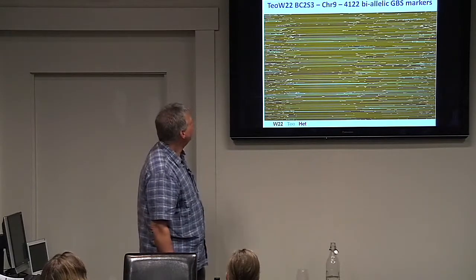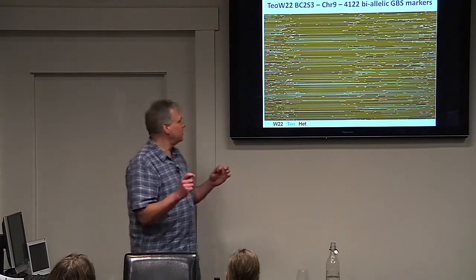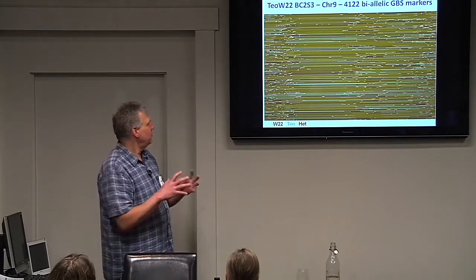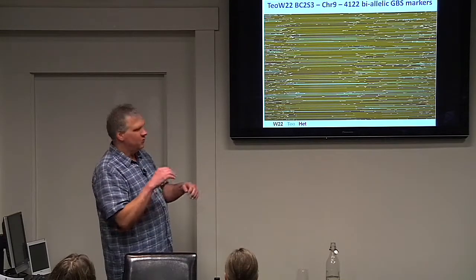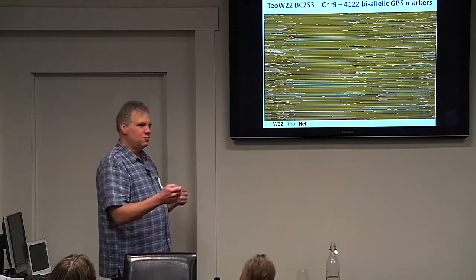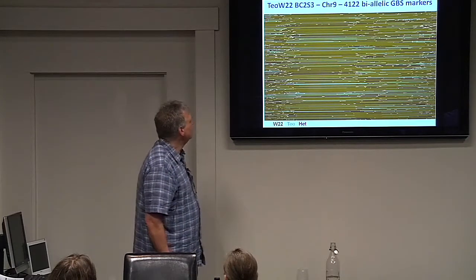It's a lot harder to see, but if you look really carefully, a lot of the white parts are the missing data where I wasn't sure where exactly the crossovers were. So I was very conservative about that and left them white. And it tends to be harder to know when you're going from a heterozygous to homozygous transition, just where the coin flipping stops and where you get a run. So those white spaces tend to be a little longer.